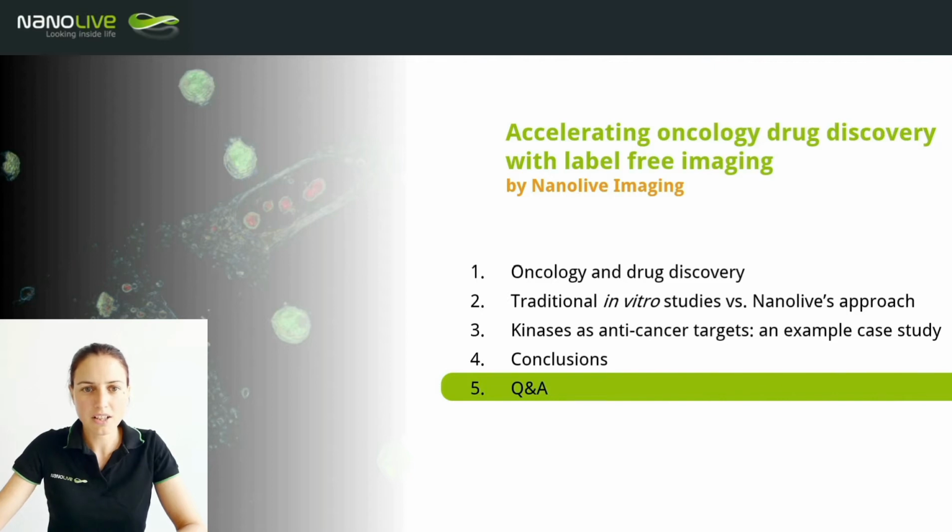Finally, the last question is, what is the maximum number of experimental conditions that can be run simultaneously? So for this, it's possible to automatically image up to 60 well plates, 60 different experimental conditions in well plates in parallel. Of course, there is a trade-off between the number of conditions that you run and the temporal resolution of your experiment. So I hope that helps.